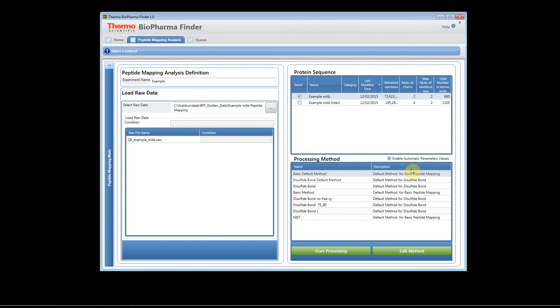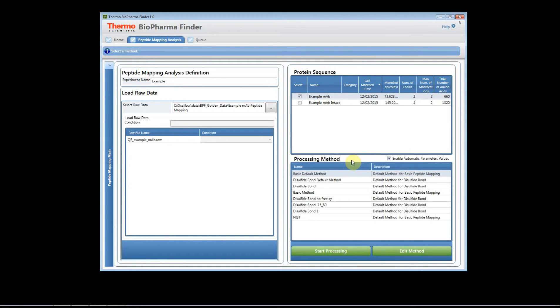Now one thing I want to point out is we have this little checkbox here that says enable automatic parameter values. How this checkbox works is let's say that you have a reference file and you use our basic default method and you just use the default parameters there.